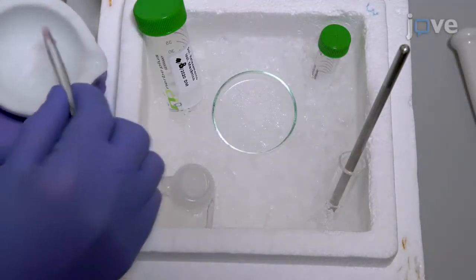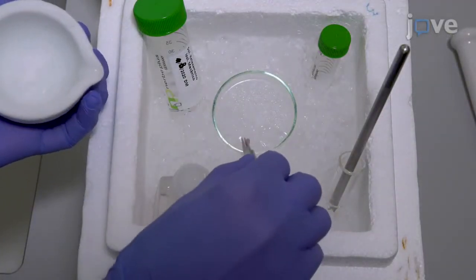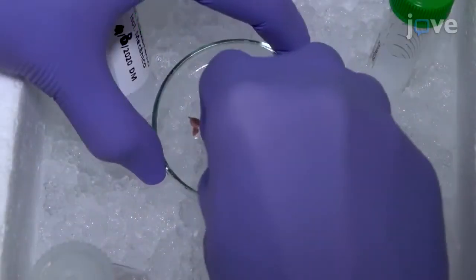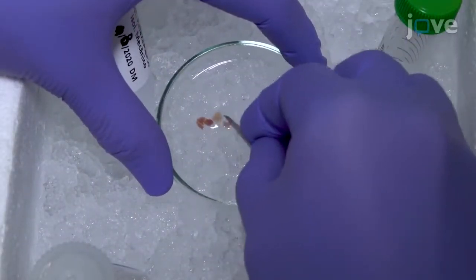The main advantage of this technique is that it allows the study of cardiac myofilament function using very small biopsies or samples that were stored frozen.